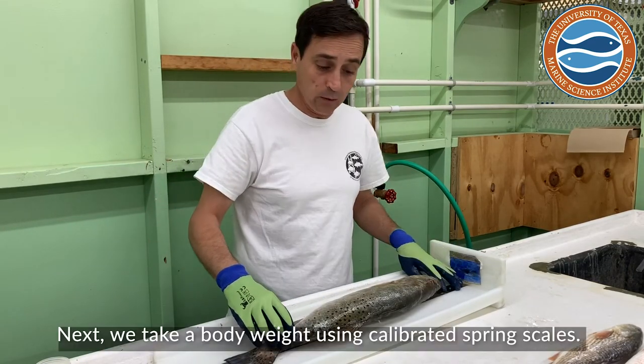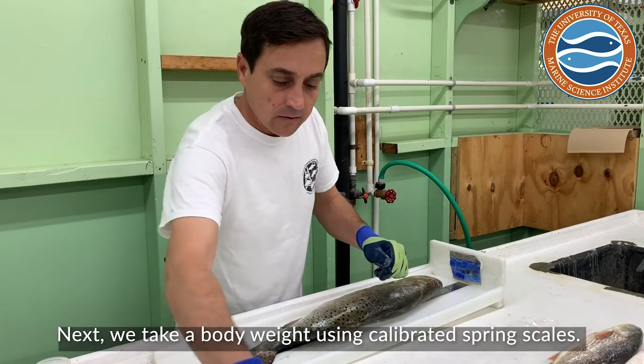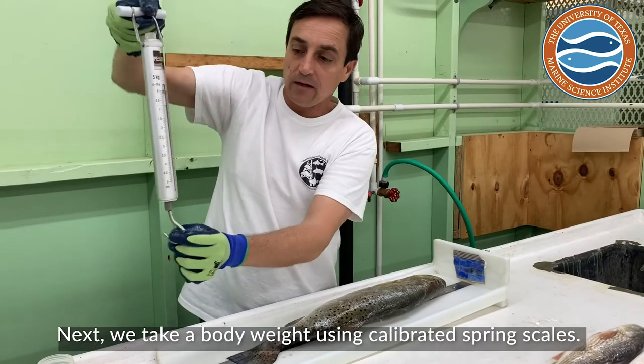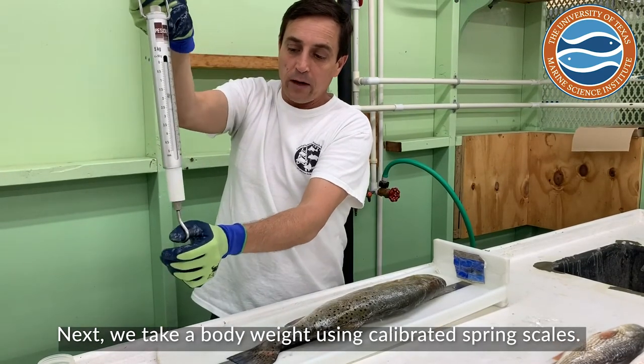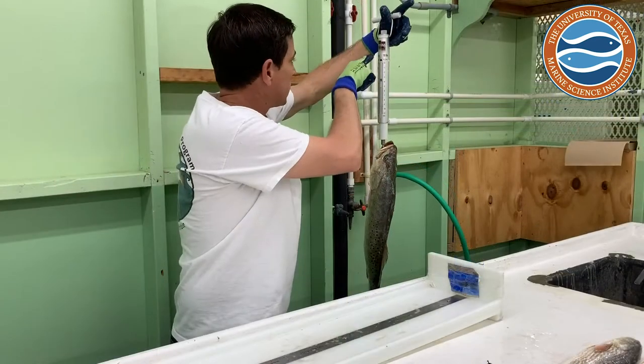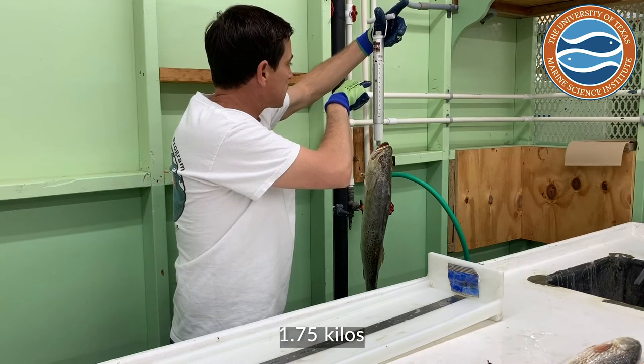Next thing we're going to do is take body weights. We have a bunch of different scales here — these are calibrated spring scales. The weight of the fish will pull these down and they're actually really precise. We have kilos on the side — 1.75 kilos.